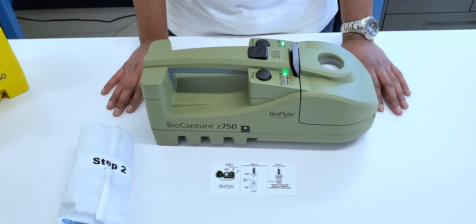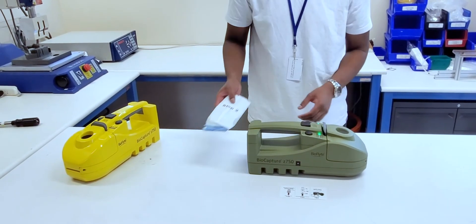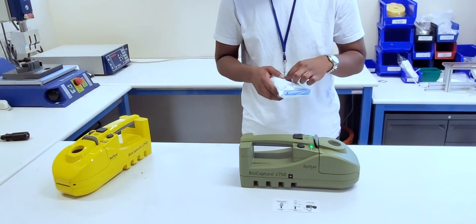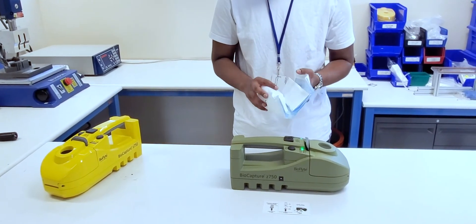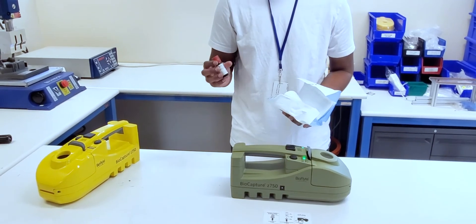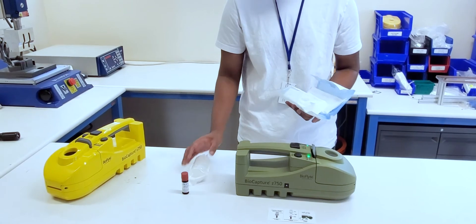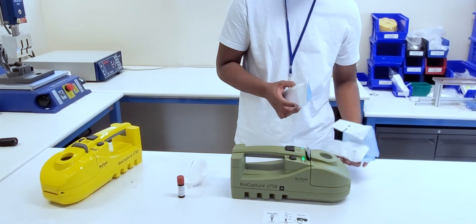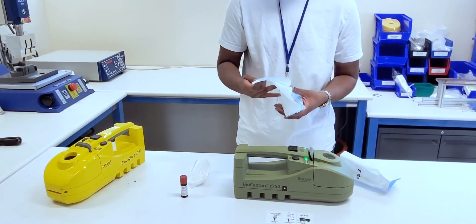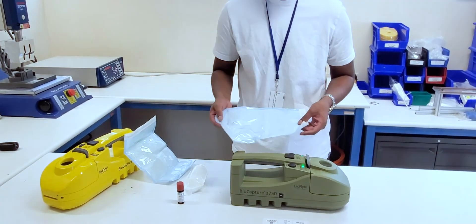We are now ready to begin Step 2. We will begin by opening our Step 2 pouch. Inside of our pouch, we will find a pressurized elution canister, the vial, the lid for the vial, and finally the elution adapter.